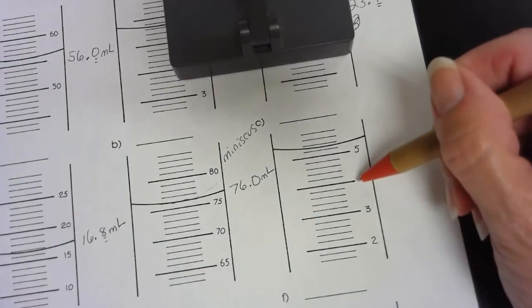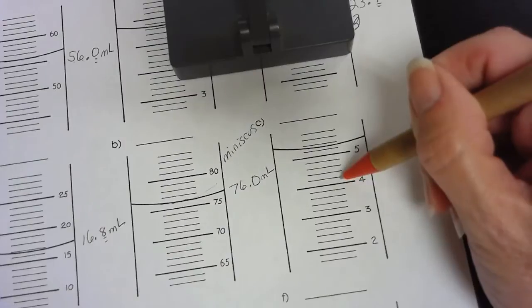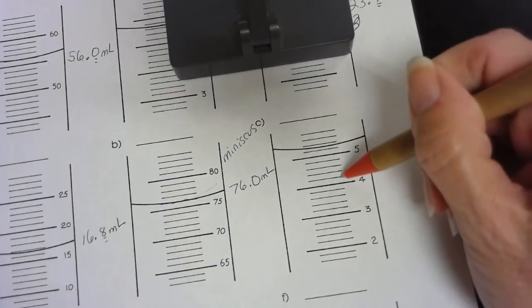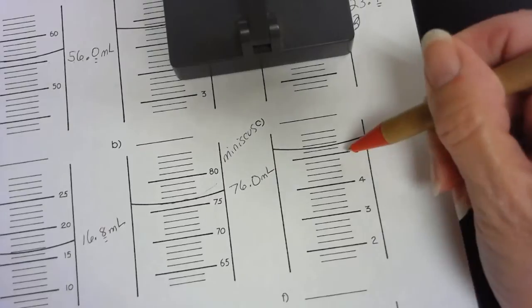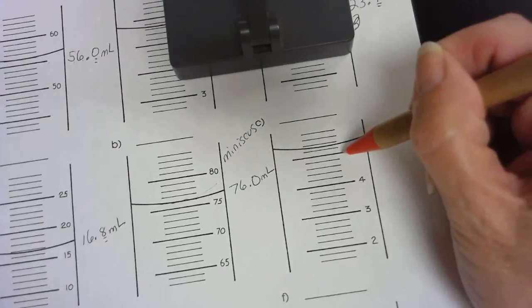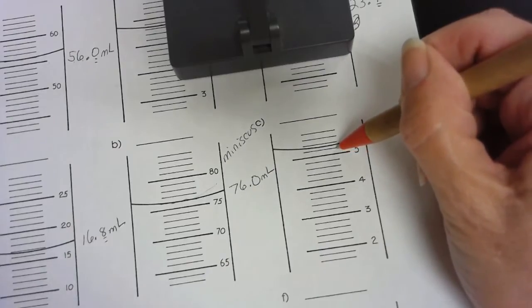This one, okay, so notice we have 1, 2, 3, 4 lines between here. So each one of these is going to be like 4.2, 4.4, 4.6, 4.8, 5. Okay, so now we've got 5.2.